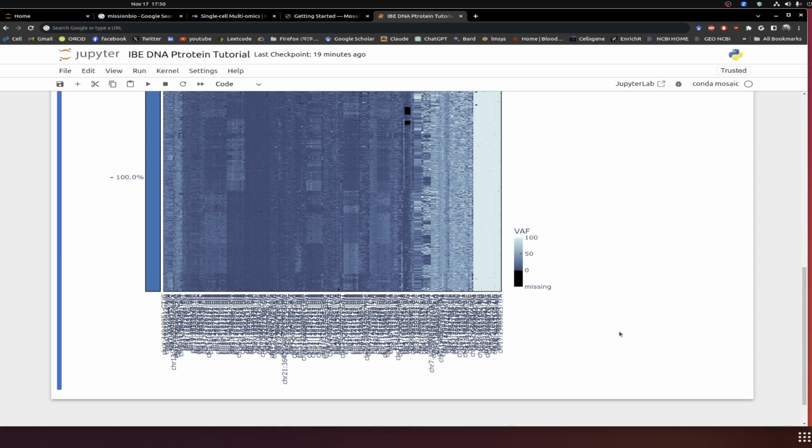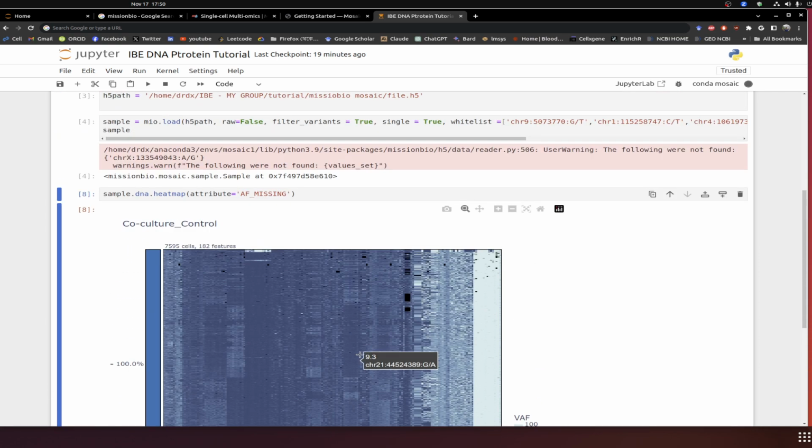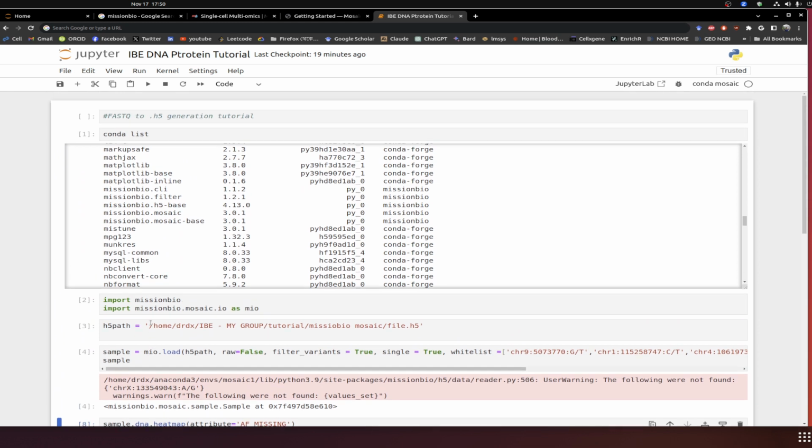Well, these are the different chromosomal positions. So we'll come through this one by one. We'll divide the clones and everything. So this is the basic, just to look at the basics in here. You loaded your samples, so that's the basic. So we'll go through a lot of these things one by one.